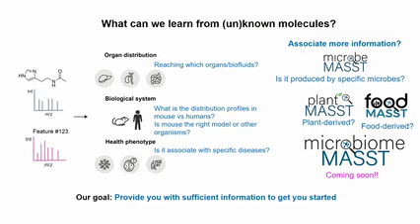So today is actually to provide you with enough information to get you started. We don't want you to be an expert in reverse metabolomics and be super fluent, but we want to give you the basics to understand it and be able to do it by yourself. Today, the workshop is meant to query a small number of molecules, let's say 3 to 5 molecules, but we already gave everything available on the GitHub to query 10 to hundreds to thousands of different molecules and to associate all these molecules to different body parts, for example.